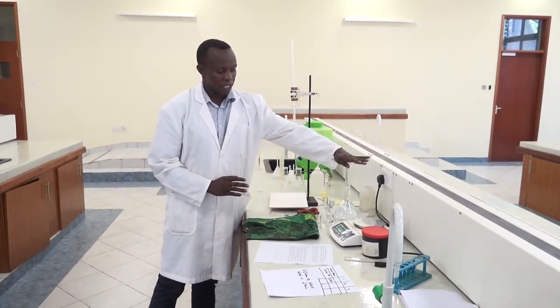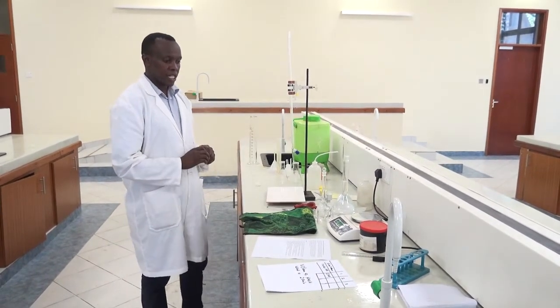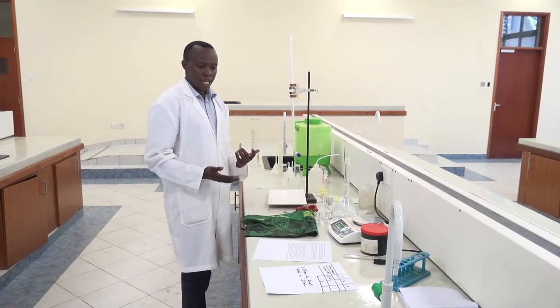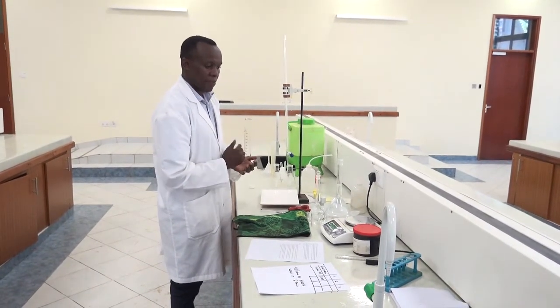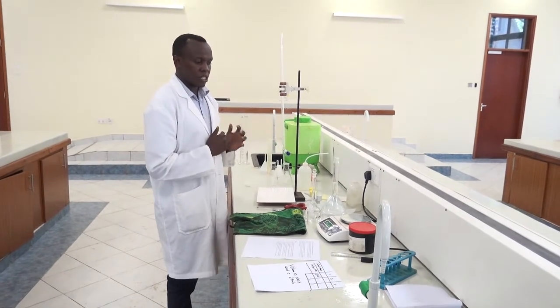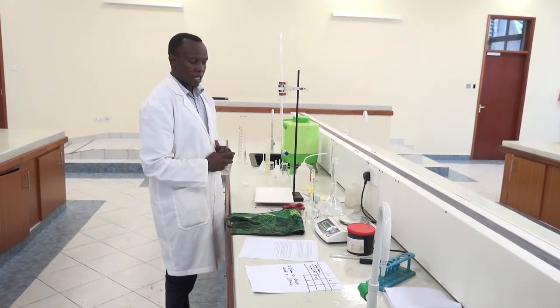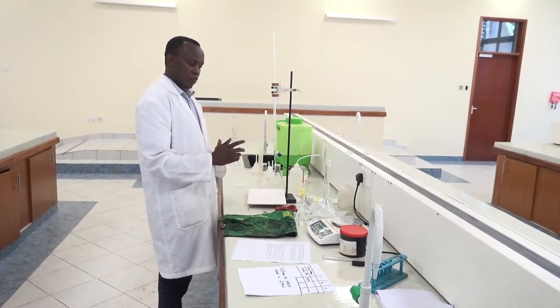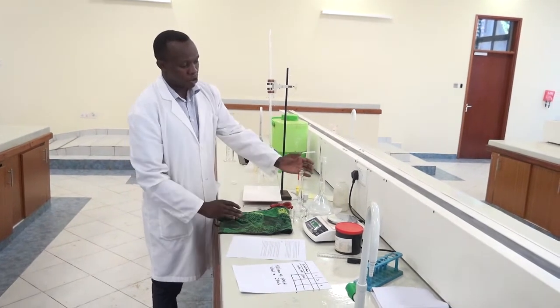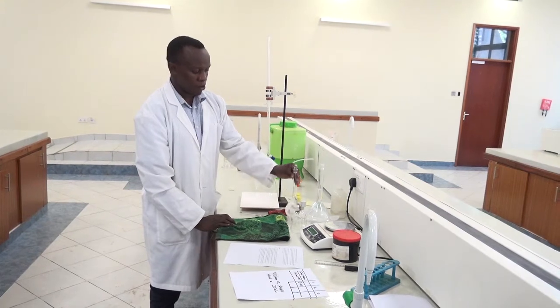I have standardized the HCl. Since it's a secondary standard, you can't just use it directly. You need to titrate with a primary standard so that you know its exact concentration. I have done that using sodium carbonate, and I've come up with the true concentration for HCl. Now I'll use my HCl to get the concentration of sodium hydroxide.